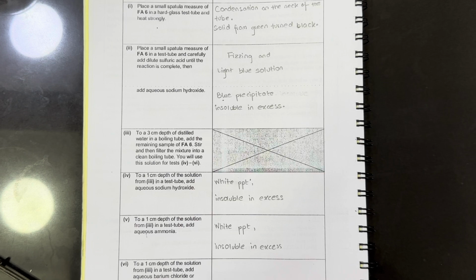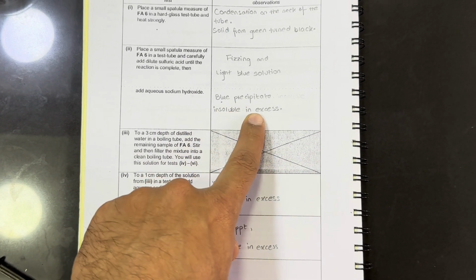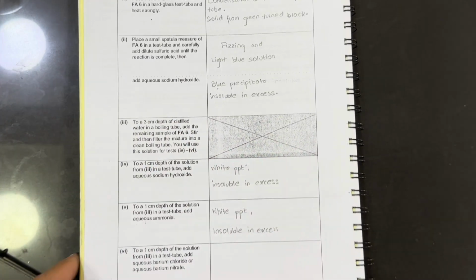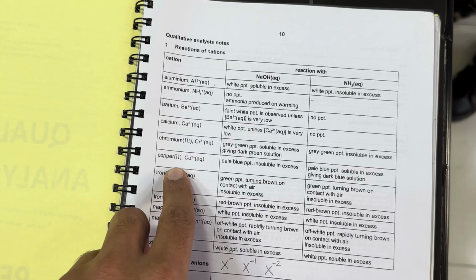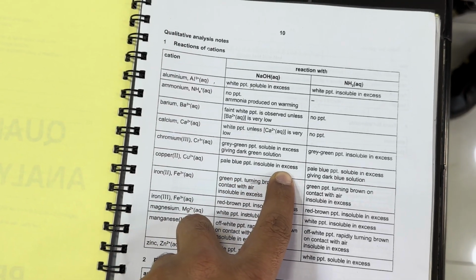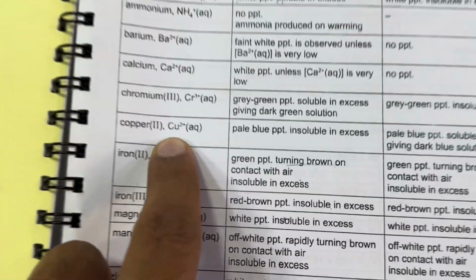So from here we have concluded that blue precipitate insoluble in excess when sodium hydroxide is added. So this is blue precipitates insoluble in excess with sodium hydroxide, means one of the cation is copper 2+.